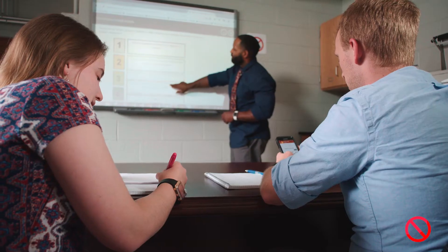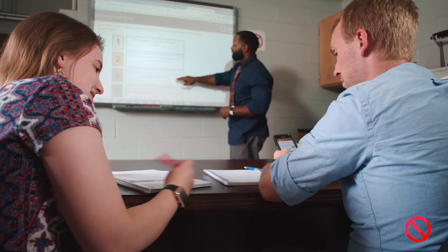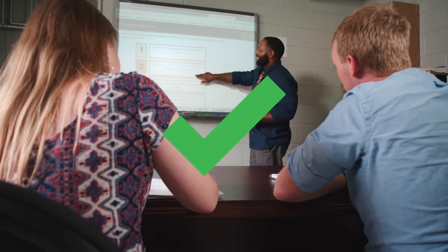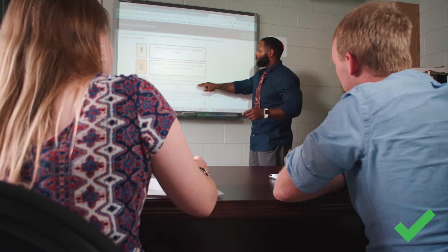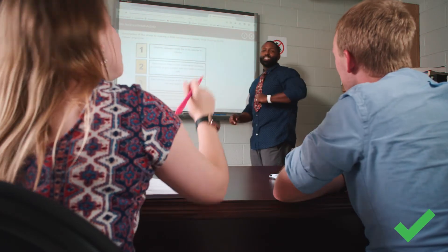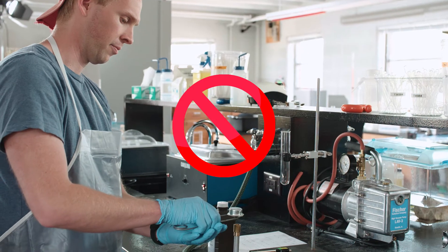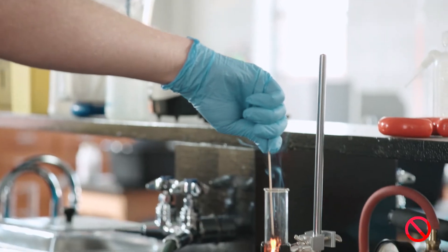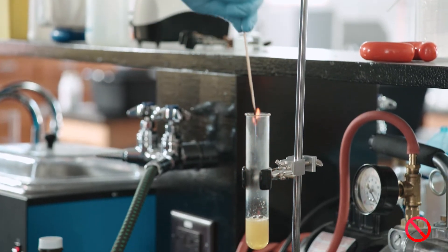Follow all verbal and written instructions given by your teacher. Never work in the lab unsupervised or perform unauthorized or unapproved experiments.